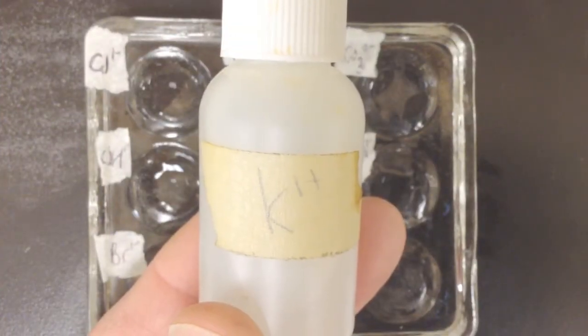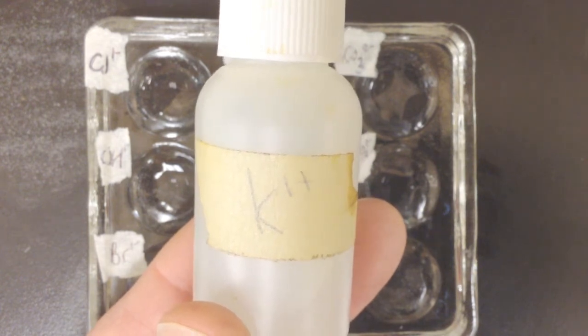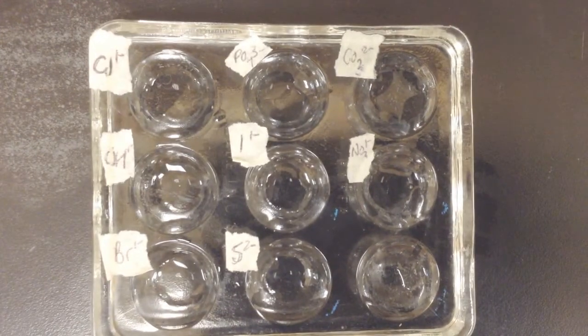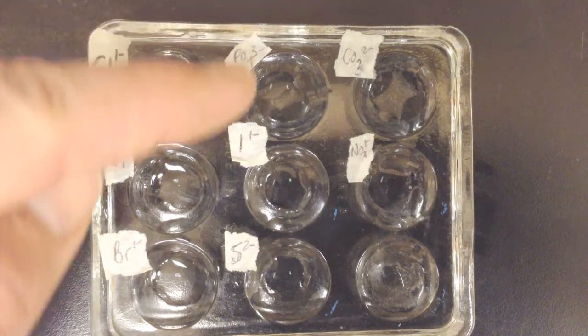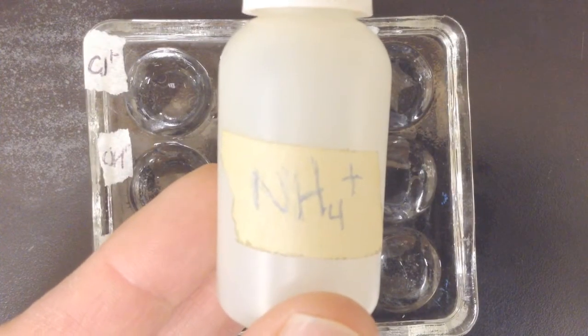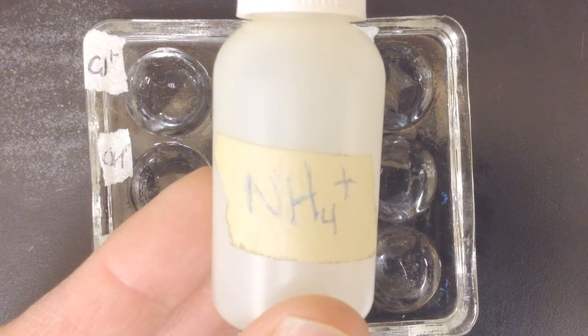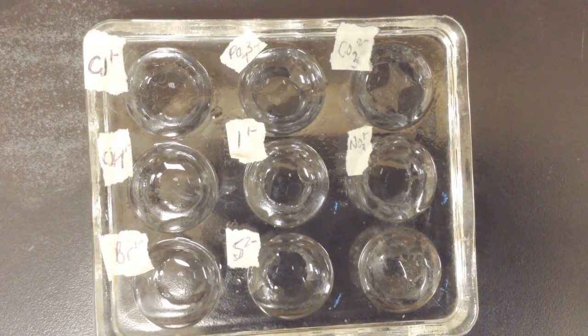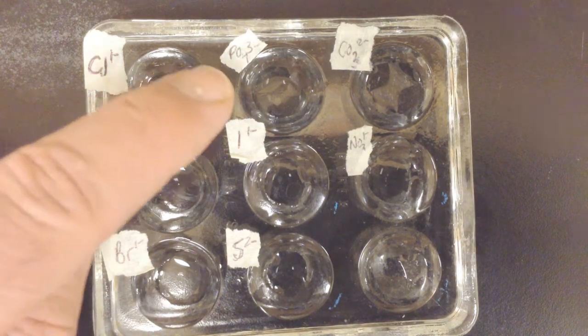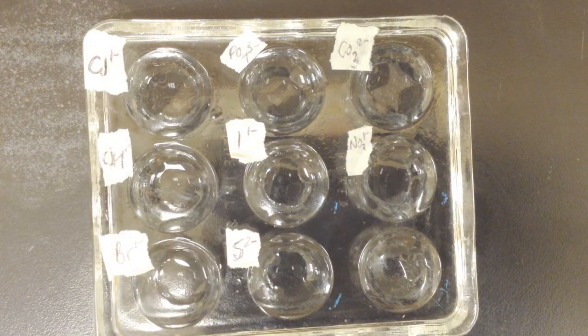All right, I've done the reaction with potassium here. I've pre-recorded all of this, or pre-did it off camera, just for the sake of time. You can see here we have no reaction between the potassium and any of the ions that are here. So potassium cation doesn't form a precipitate with any of these anions. Next up is NH4 with a 1+ charge, ammonium. Again, this lab is starting off without much excitement on the precipitate front. We've added ammonium with all of these anions, and you can see that none of them formed a solid precipitate. Let's move along to the next one on your list, that is lead.